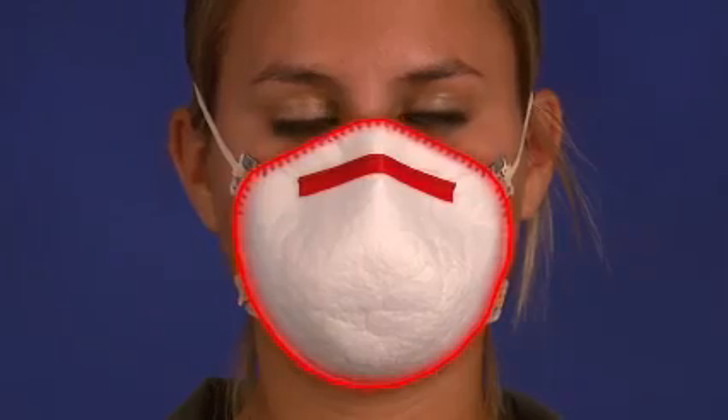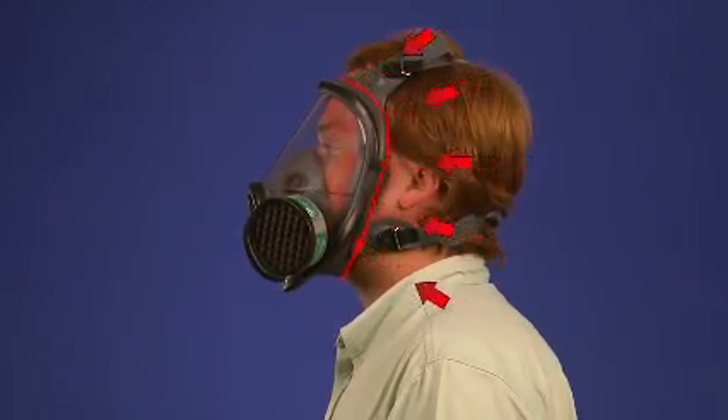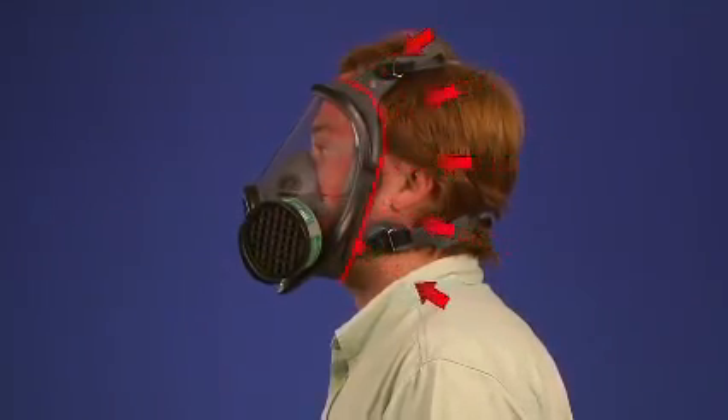A respirator can't protect you if it doesn't fit your face. It's that simple. Certain respirators, known as tight-fitting respirators, must form a tight seal with your face or neck to work properly. If your respirator doesn't fit your face properly, contaminated air can leak into your respirator face piece, and you could breathe in hazardous substances.